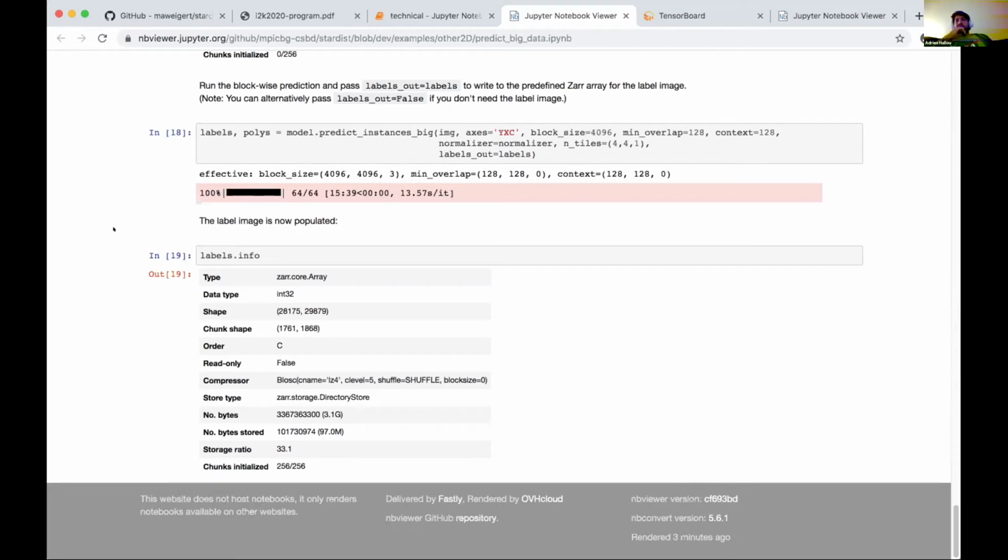Yeah, actually, I have a question. Coming back to my point before, when you're a user but you have a very small annotated data set, I was thinking it could be interesting to use a model which is already trained on a very large data set, and then use this model as a starting point with your limited annotated data set to train it and get a good result.